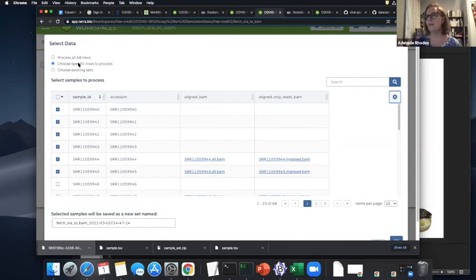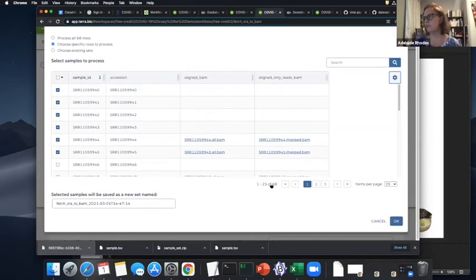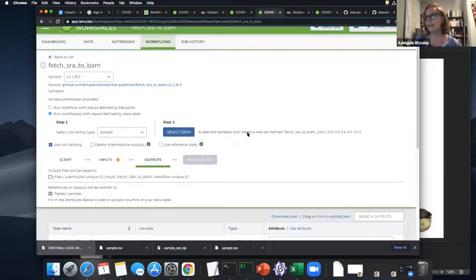Okay. So I can choose specific rows. And when I do that, it lets me run the, sorry, there's just a little error here because I doubled up on the workspace. I did something and I have too many screens open. Sorry, don't worry about it right now. But anyway, yeah, so you can select and sub-select.